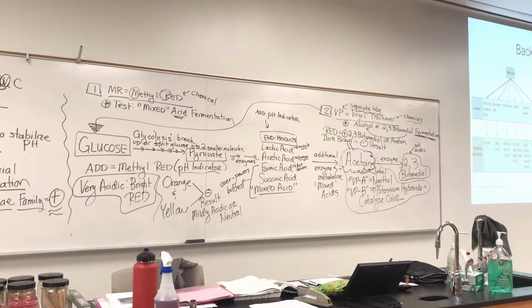Well, I'm guessing that the first part. Well, since when you ferment glucose, you get acid either way, fermented acid. So I'm guessing the other part might end up being negative.